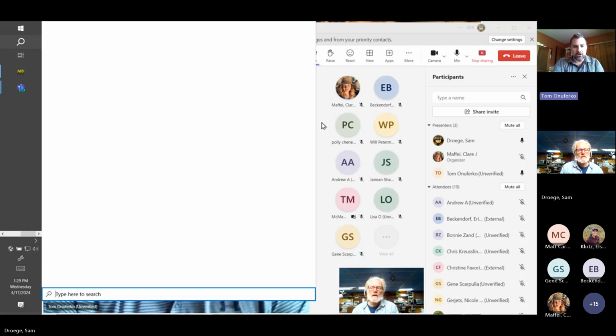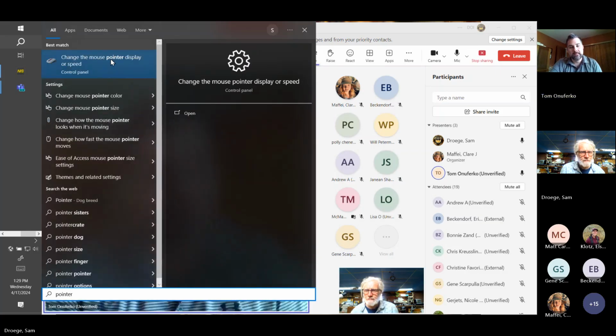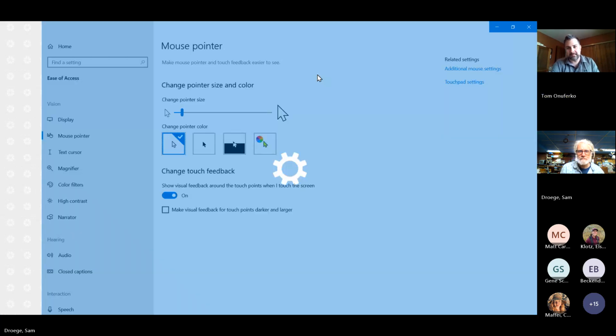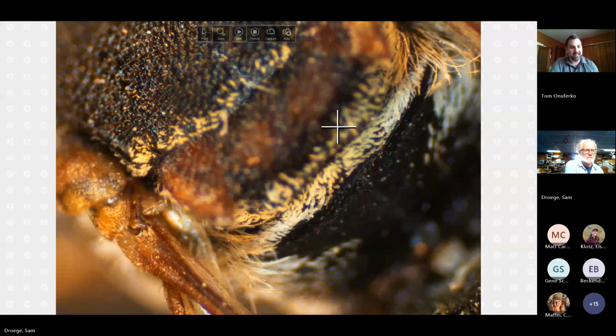When looking at it, I would try to look at it like it is in the image, just flat from the top, as opposed to an oblique view, as close to a perfect dorsal view as possible. Because if you rotate the specimen, in some views it will look like the axillae don't go that far back, and in some it will.